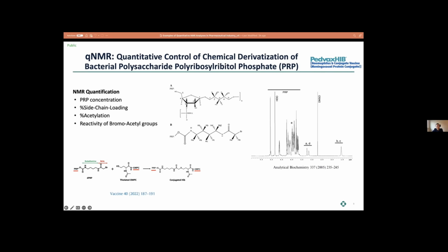because sometimes when we manufacture them, the media may not be used instantaneously, maybe held for a certain time, and actually bromine was lost. And we're using the NMR approach to characterize how much bromine actually remained in the intermediate production steps. So this is an example of using quantitative NMR for our product process control and product release.